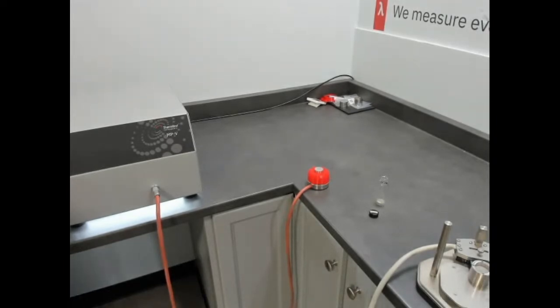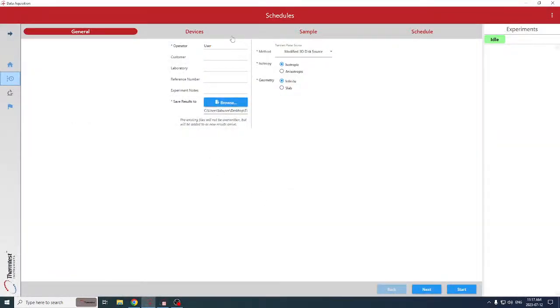Okay. So here's our main MP-V software. The software for the MP-V is separated into two applications. One is data acquisition, which lets us schedule measurements. It's a smart, convenient application that gives us a lot of capability spread over a nice landscape of software. The second application is transient analysis, which is where we do calculations.